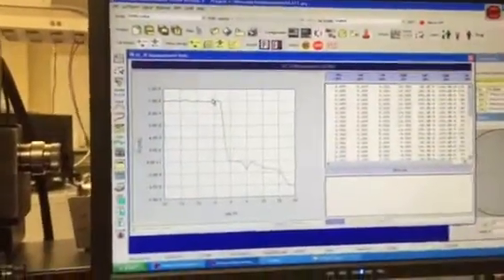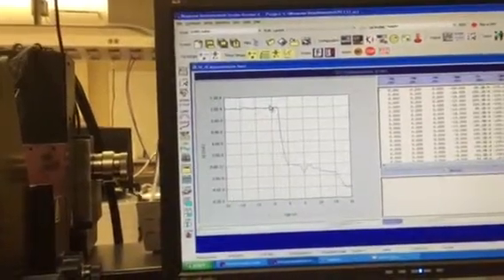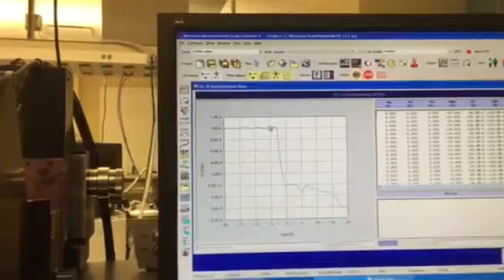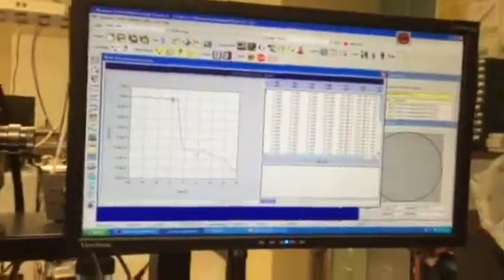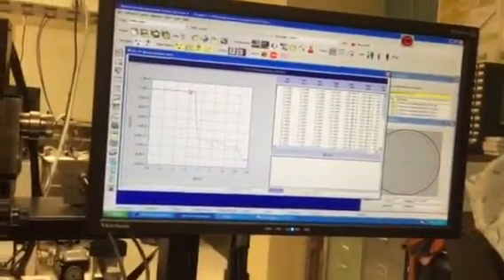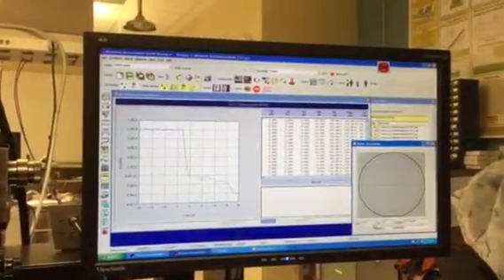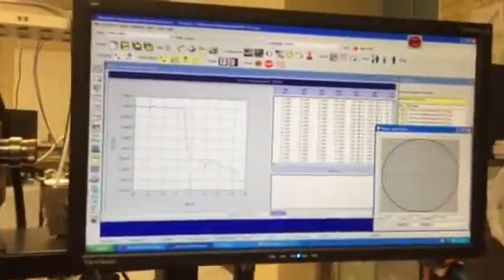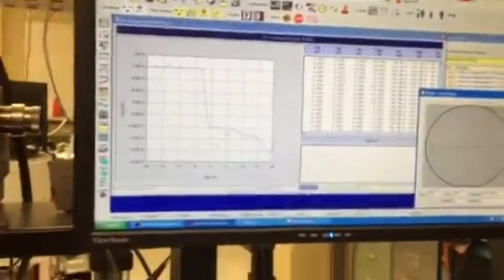Maybe it will be nice to know how many we already measured. Usually it will show you, but again the problem is we're not zooming. Usually it shows you right over here. It actually is showing you what ones are being measured. But the trouble is it's too small. It comes back to that thing again that the display is too small, so we need to take care of that. Done. It's done measurement. Oh, it's finished, yeah.